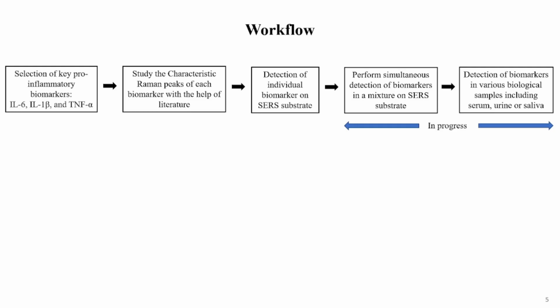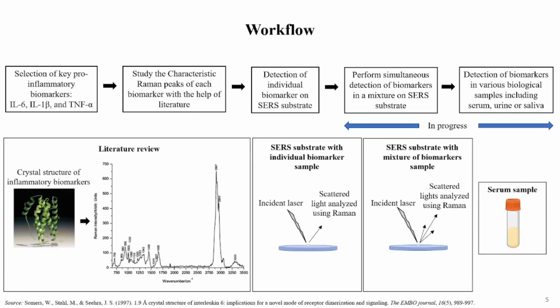The third step was to detect the individual biomarkers on the SERS substrate which was prepared by Mr. Sarvar Singh, and later perform the simultaneous detection of the biomarkers in a mixture, which is basically detection of all three of them together on a SERS substrate. And the last step was to detect the biomarkers in various biological liquid samples like urine, saliva, and serum. The last two steps are actually work in progress. I've just added a visual representation of the workflow that I did.